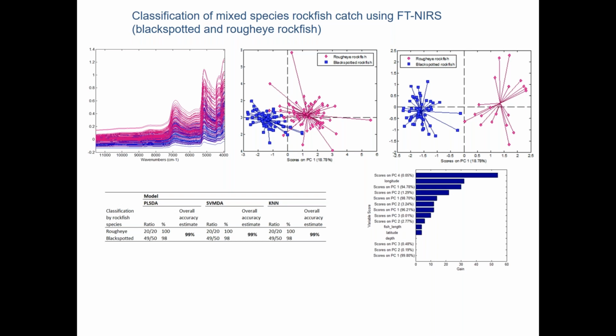Plus group is something, or I guess in terms of this, the spectra is actually coming from the entire otolith sample. So age does not enter into this particular analysis like it would, say, in trying to identify the edge type or the plus group for age estimation. Now, that may be more of an issue related to using this technology to estimate the age of fish.